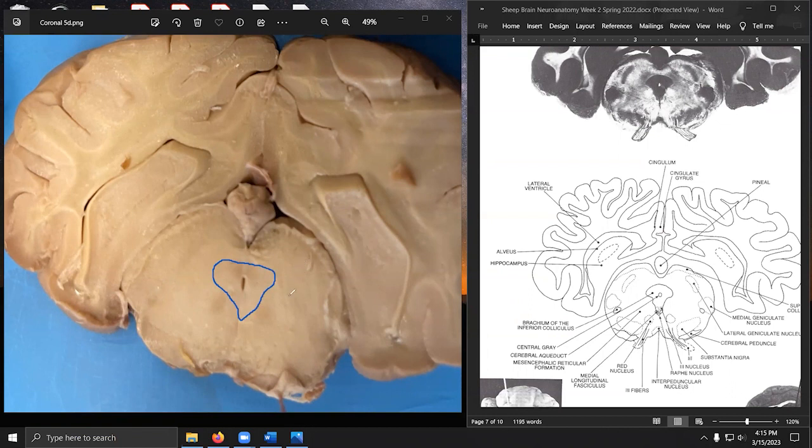We do see these spots. This is another optional area that I didn't mention in lab, but we can actually see here in this image. Red nucleus. The darker spots correspond to the red nucleus here. We can actually also see the brachium of the inferior colliculus. Again, another optional area, but darker spot on this image. In this case, the lateral geniculate nucleus and the optic tract have pretty much gone away. What they're going to be replaced by is that this upper layer here is the superior colliculus, another vision-related area. And it'll get larger in the successive sections, or well, one of the next sections.